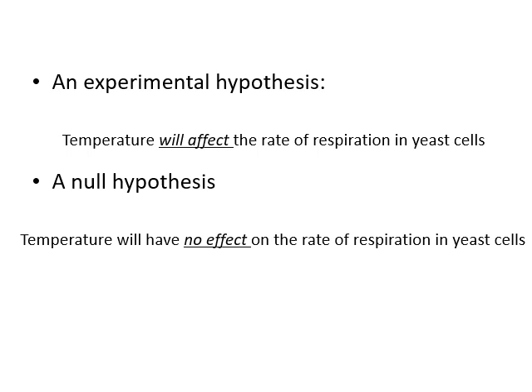What we are hoping to see is that as we increase from room temperature to 37 degrees, obviously our yeast should not be adversely affected by this. The enzymes present within yeast shouldn't be denatured by 37 degrees. However, that extra thermal energy should be converted to kinetic energy, and hopefully what that will result in is more frequent successful collisions between key enzymes involved in respiration, and therefore more enzyme substrate complexes and a greater rate of reaction.